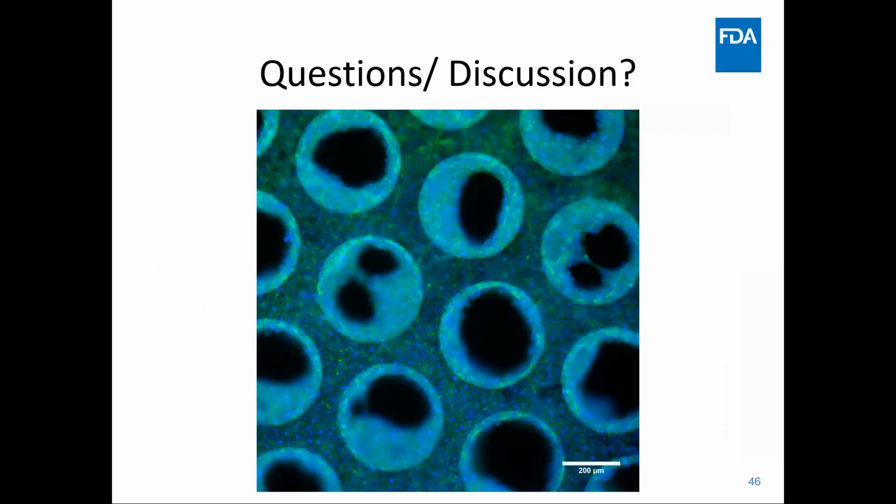So Alex, our first question is, what are the criteria required for a great, robust and reliable organ-on-chip model?